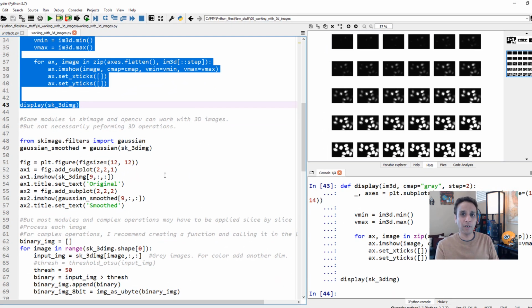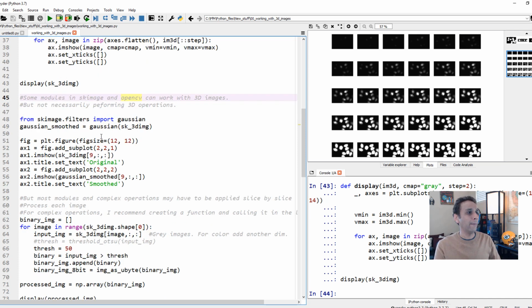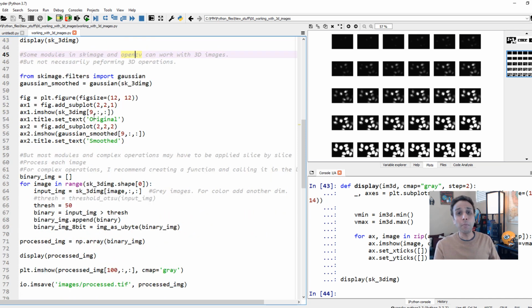And there are some libraries like Napari, for example, and a couple of other libraries that allow you to visualize 3D images in Python. I tried to install a couple of those, but it comes with so many dependencies that I gave up after a while. So this is fine. I'm looking at cross sections and I have ImageJ. I'm good.